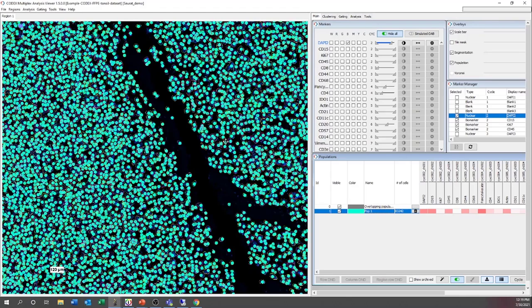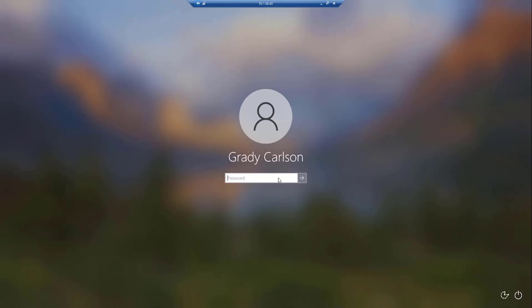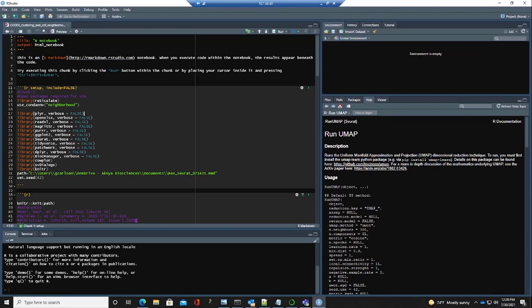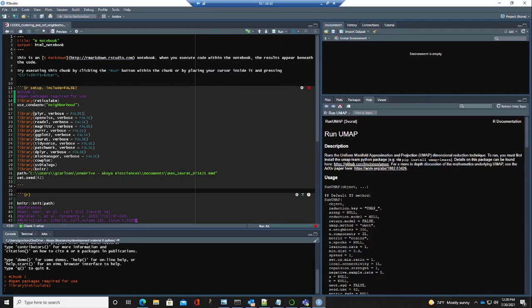The next step is to analyze our data with Seurat to compute clustering and then run scripts from the coordinated cell neighborhoods paper by the Nolan Lab to calculate cell neighborhoods for this sample. We'll access R, and we have all these scripts pre-written. All I need to do is open my appropriate libraries, access the path, and knit the markdown document to execute it. All of the user inputs are GUI-driven — you'll see pop-ups asking for information. Let's run all.